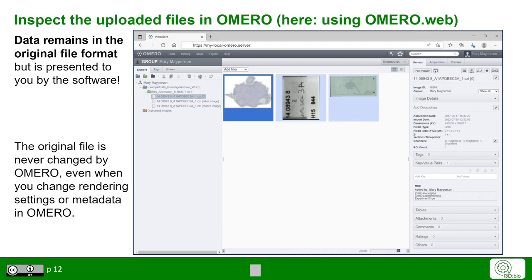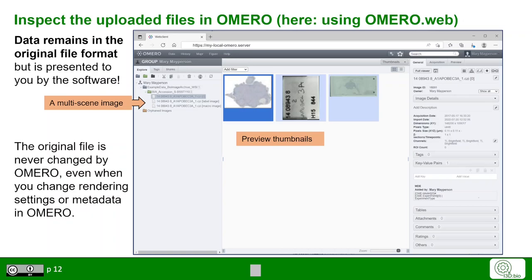Our example in Omero Web looks like this. Here we uploaded data to the new dataset shown with the green folder icon. In this case, the image has multiple scenes, which is a specification of this imaging type. In the middle, we see the thumbnail previews of this image and the different scenes. On the right-hand side, we see the metadata.